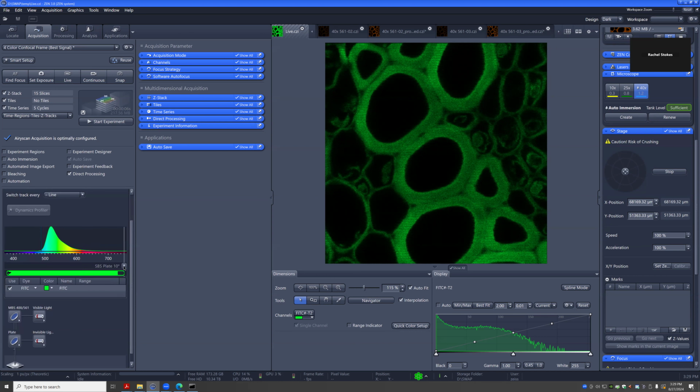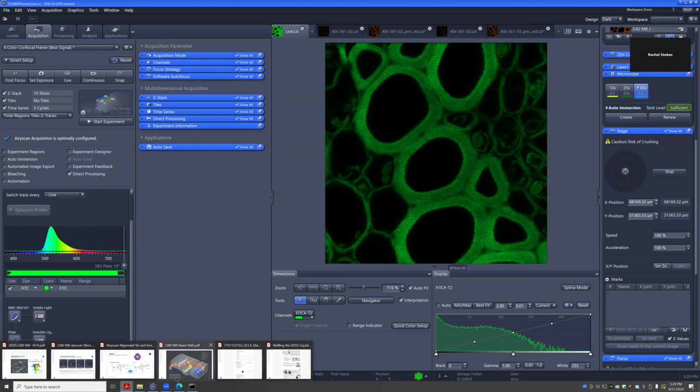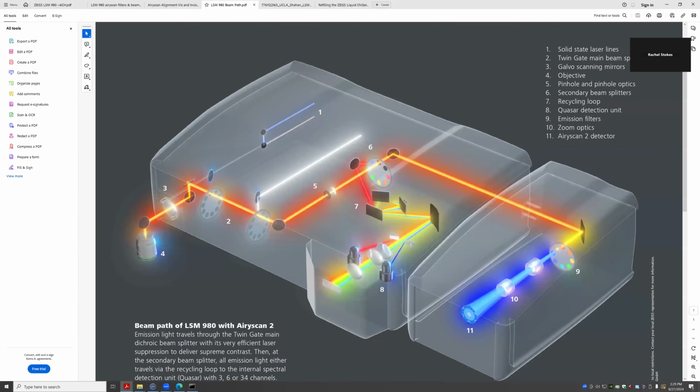So for the area scan, that'll be filter based. You'll see them here in this drop down. We should put up that poster because that makes it easy. We'll just point at the poster. But basically, it'll show this image, right?